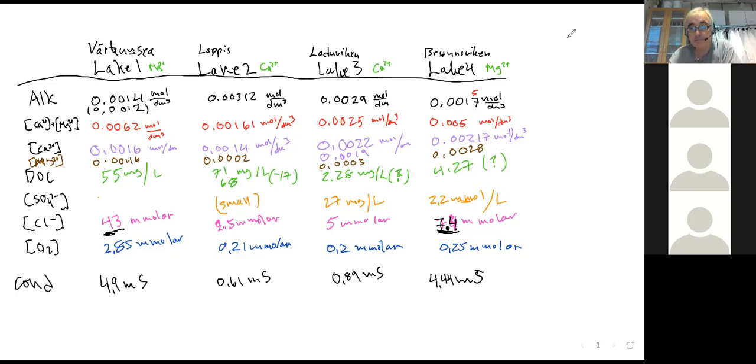Interesting, because this is approximately the pattern that distinguishes seawater from lake water. And here you have a possible way of determining whether your unknown water in a crime series or something like that comes from the seaside or from a lakeside.